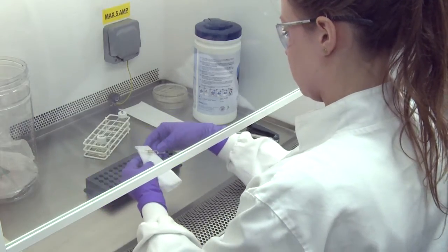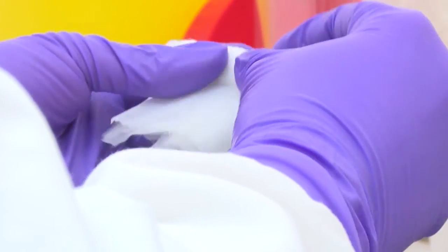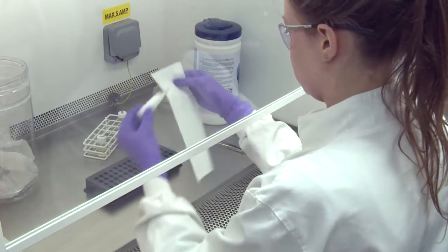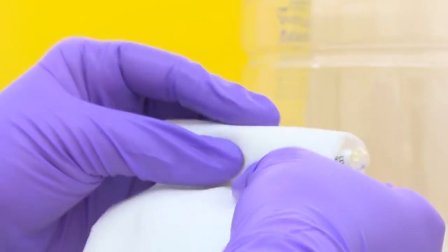Wrap the ampoule in a disinfectant wipe or tissue soaked in 70% alcohol. Then wrap some paper towel around the outside of this to secure a protection layer to prevent penetration of glass when the ampoule is snapped.